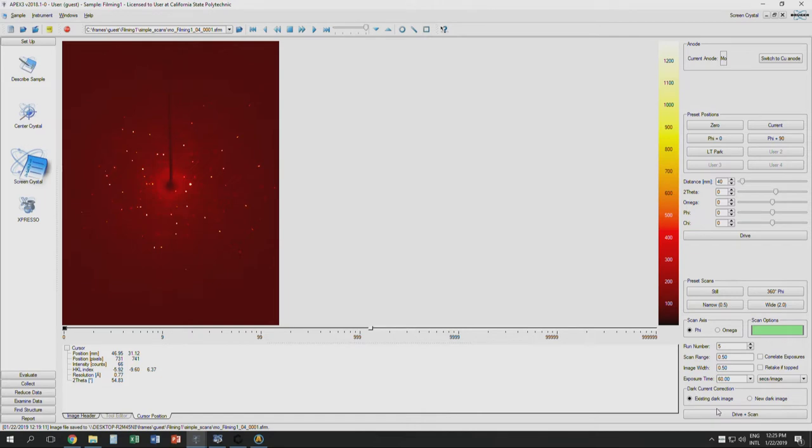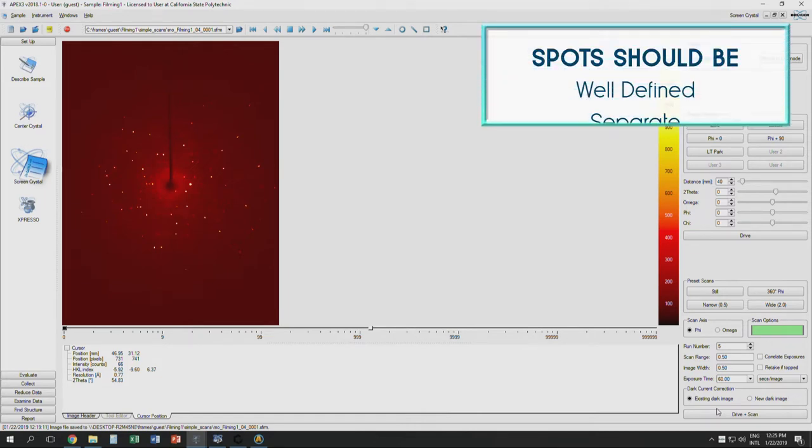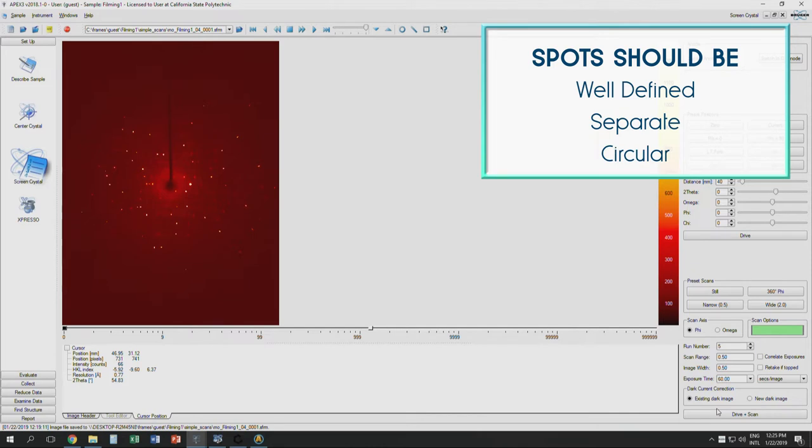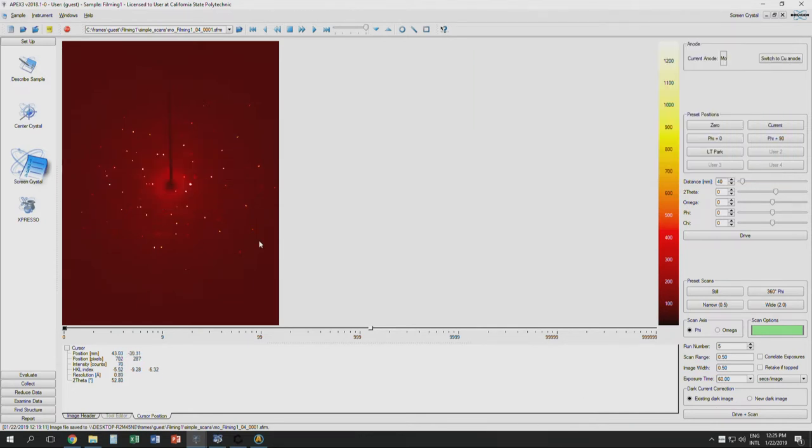For a good crystal, the spots will be well defined, separate, and circular. Notice also how the spots seem to have a pattern to them. This is the first gauge of the quality of your crystal.